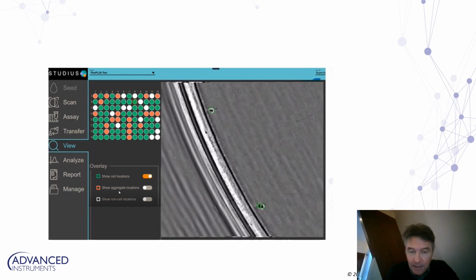It's still one cell, but it's about to divide, and the automated evidence of clonality has defined it as one cell. In the lower half, we see two separate cells in a doublet, and the AEC algorithm has picked it up as two separate cells and put green boxes around both of them. And this just shows the power of the AEC neural network.